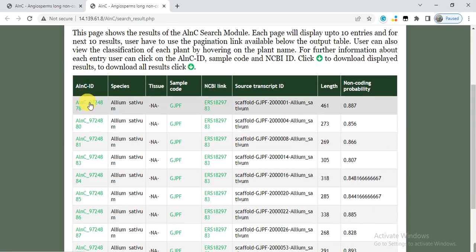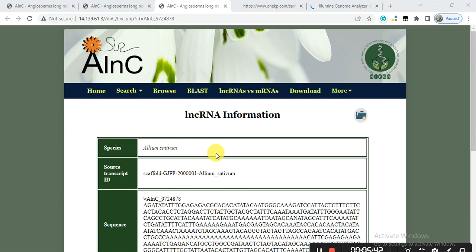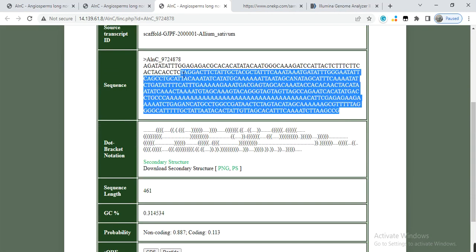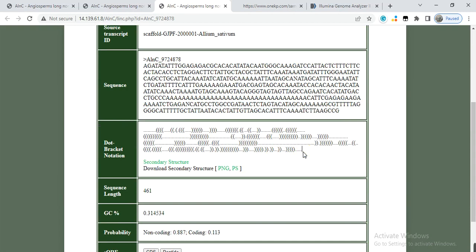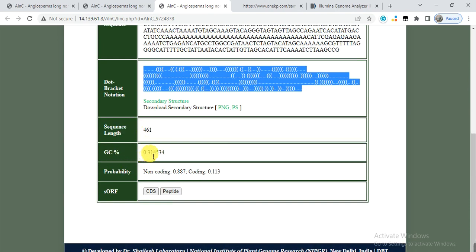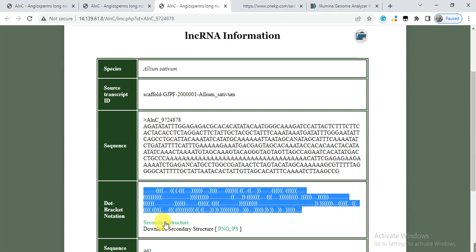You can check the results one by one. When you click on a record ID, it gives the detail of that long non-coding RNA — the species name, the transcript ID it was taken from, and the sequence of the long non-coding RNA. There is also a dot-bracket secondary structure; if you copy this and paste it into software like Forna or similar tools, it will give you the 2D or 3D structure of that RNA. Additional details include sequence length, GC content, probability, and ORF, CDS, and peptide sequences.